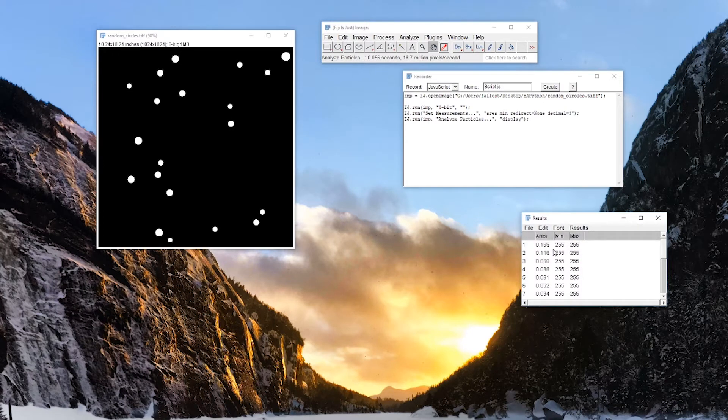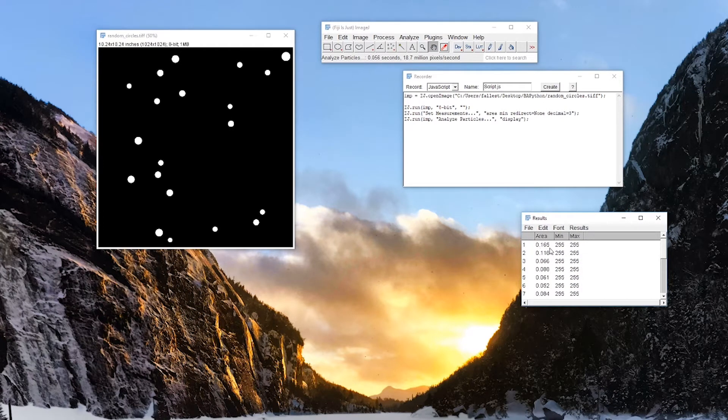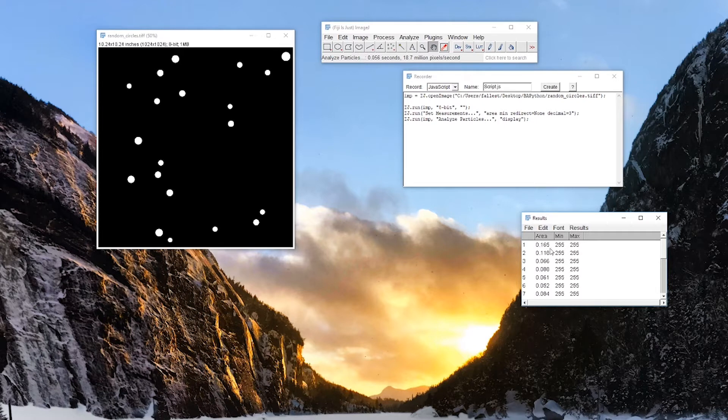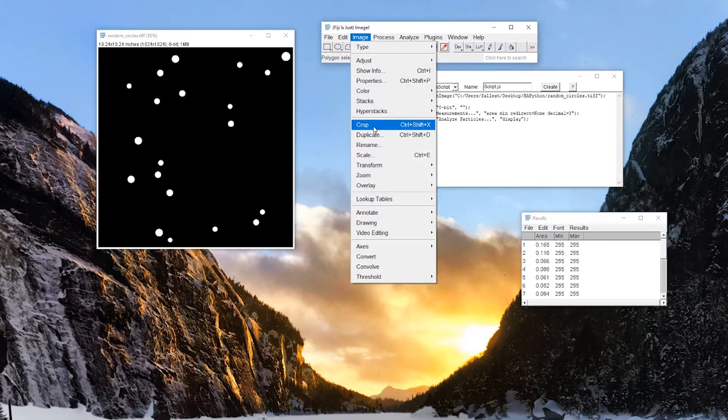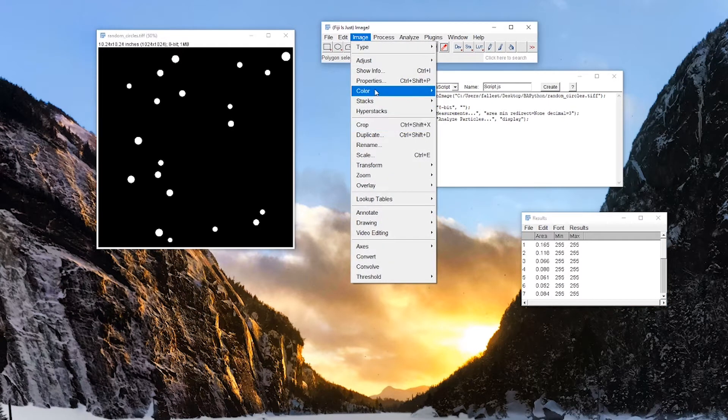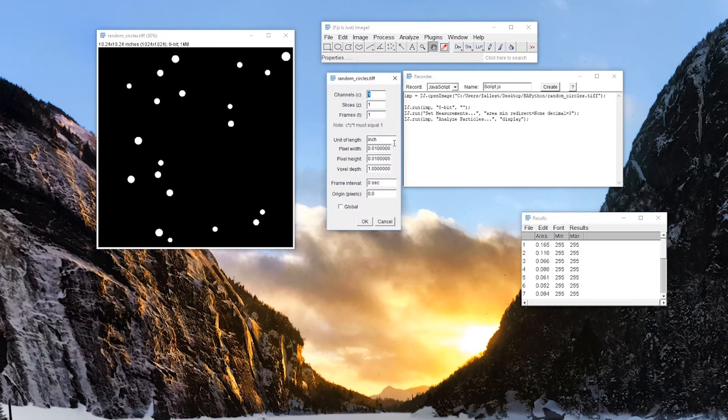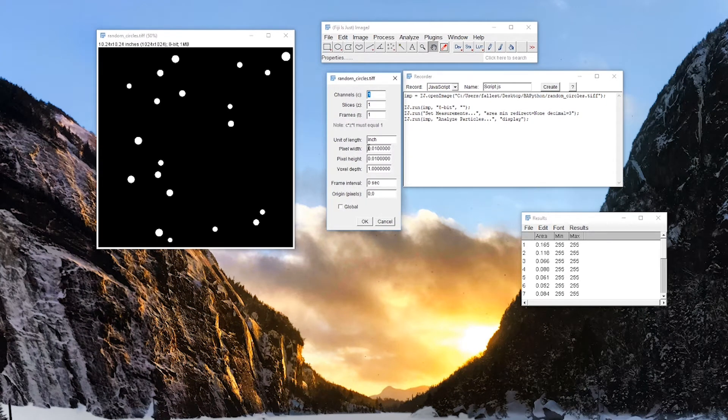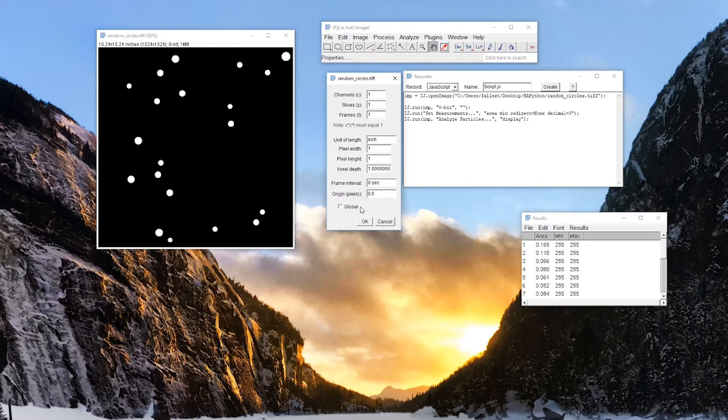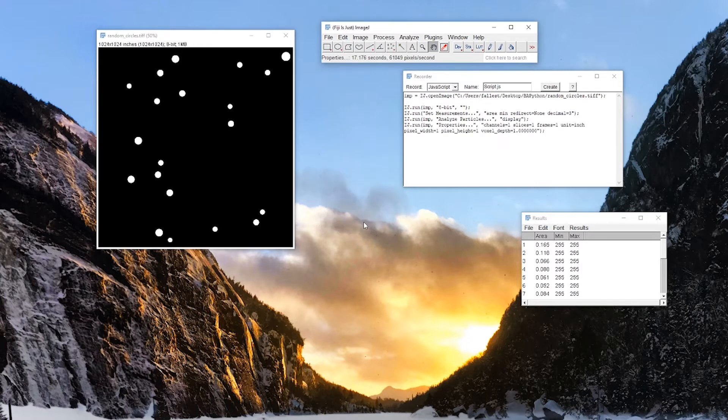Now one thing I notice is that its area is very small, 0.165. So that's because if I go up into here, properties, my pixel width is listed at 0.01 inch. So what I can do is turn this pixel width to 1 and 1 for 1 pixel. And OK.